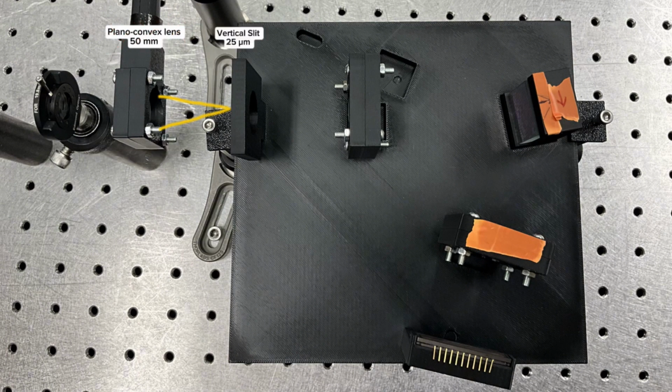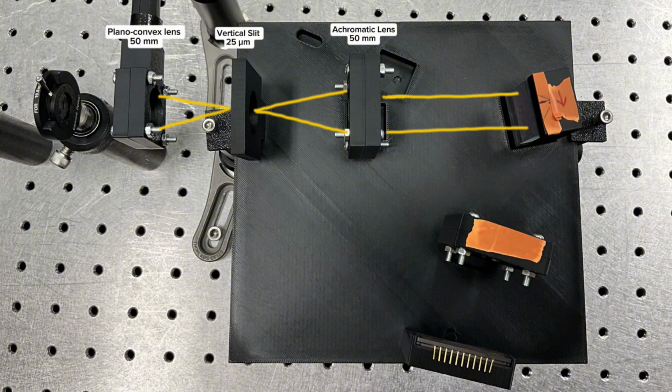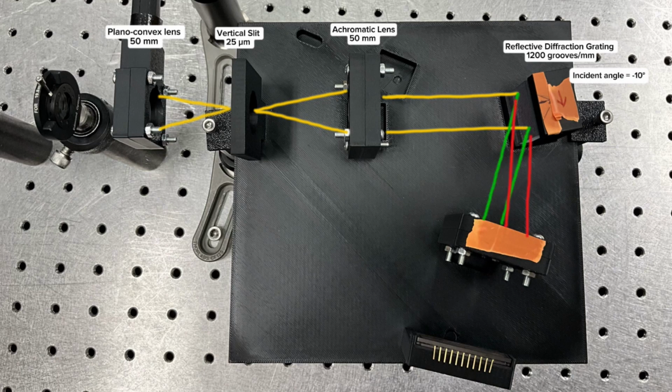The 25 micrometer vertical slit acts as a spatial filter and is the primary resolving element of the system. The light will diverge through the slit and be collimated by a 50mm achromatic lens. This collimated beam will then be incident onto a reflective diffraction grating with a groove density of 1200 grooves per millimeter. The diffraction grating will disperse the Raman signal, bending different wavelengths at distinct angles.